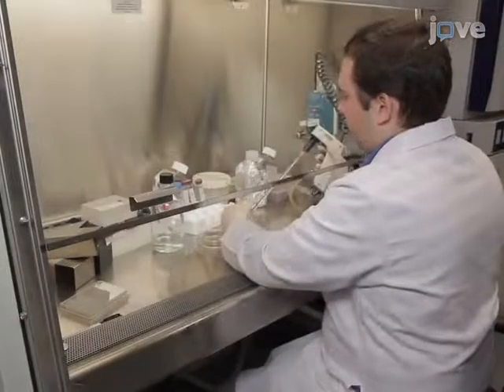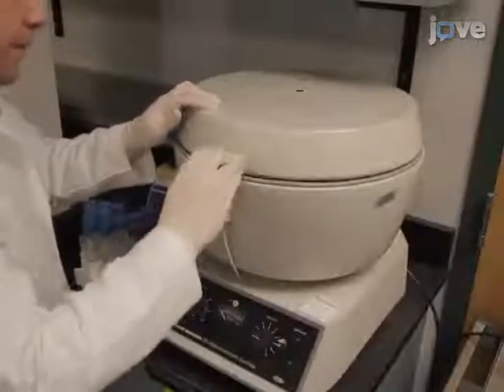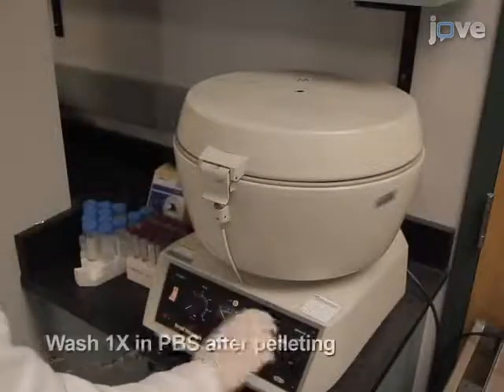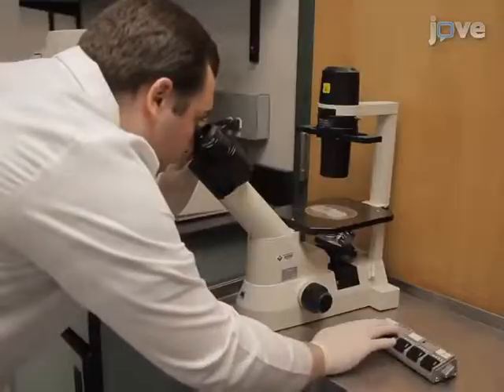Wash the cells with PBS, then detach with 0.05% trypsin EDTA. Pellet the cells at 2,000 RPM for 5 minutes, then wash them again with PBS. Count the cells using a hemocytometer.